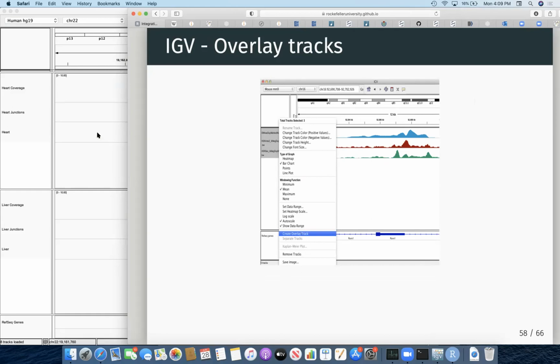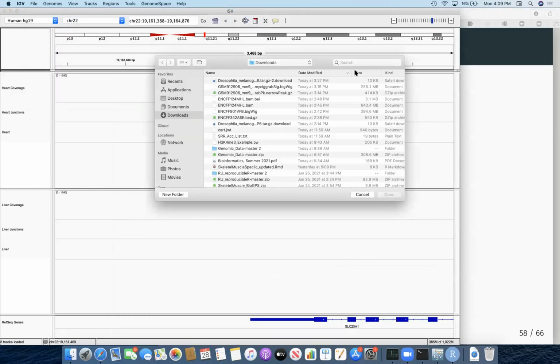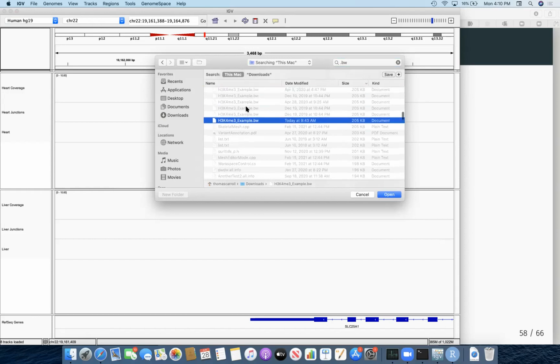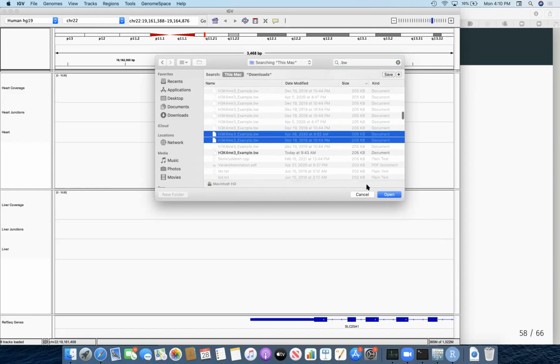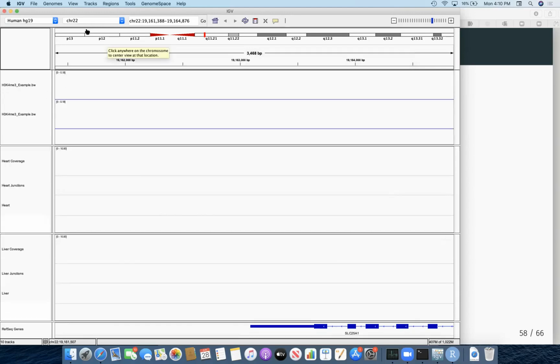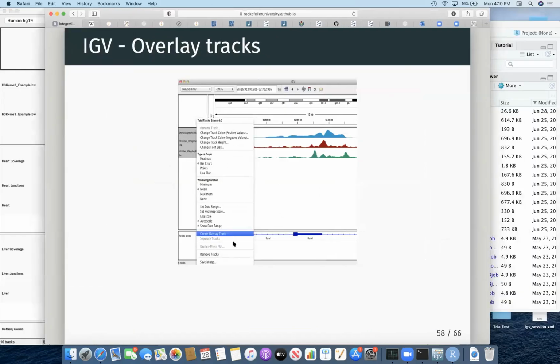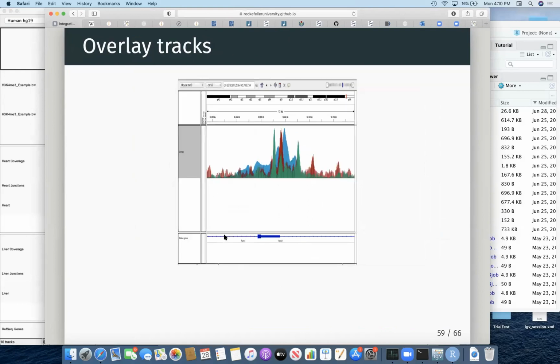And it's just if I take 2 tracks, let me try and load 2 tracks. Bigwig. Geez, we haven't had enough data today. Well, these all look like the same data. Let's try that. Well, we'll do it in the exercise anyway, rather than me hunting for data at the end of this. But as long as you make them different colors, you just select the tracks and do create overlay track, and it just does this nice overlay, and then you can start to see the differences.